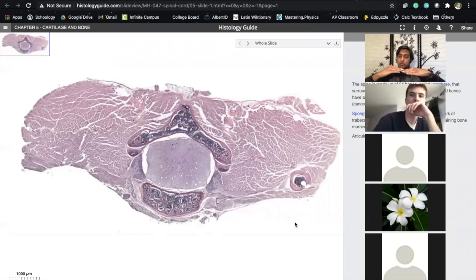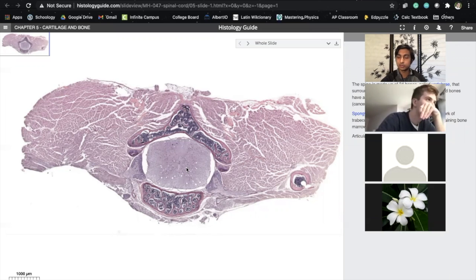All right, so you can imagine kind of a cross-sectional cut where here in the middle, can anyone give me an idea of what exactly this here in the middle might be? Either unmute, raise your hand.